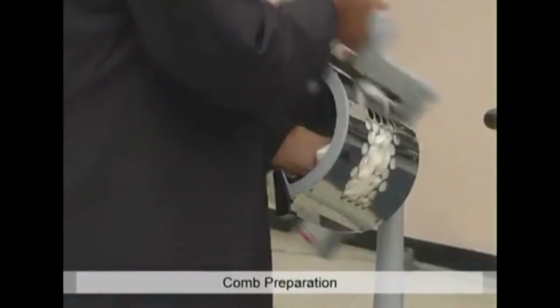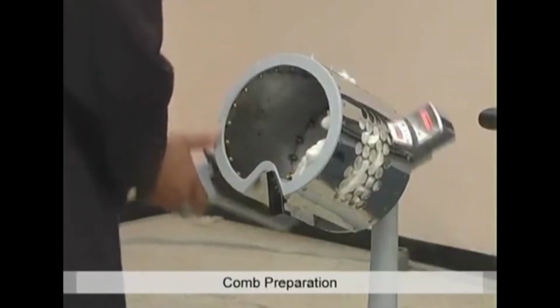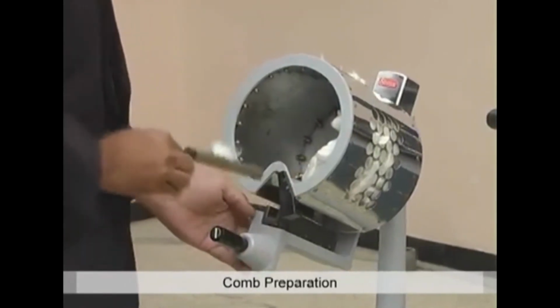The pressure is maintained and the sample holder is rotated around the drum counterclockwise through 360 degrees. The loaded comb is removed from the holder. Turn the sample in the cage to expose a fresh surface and mount the fibers on another comb. Either one or a pair of combed beards constitute the test specimen, depending upon the model of the instrument being used.